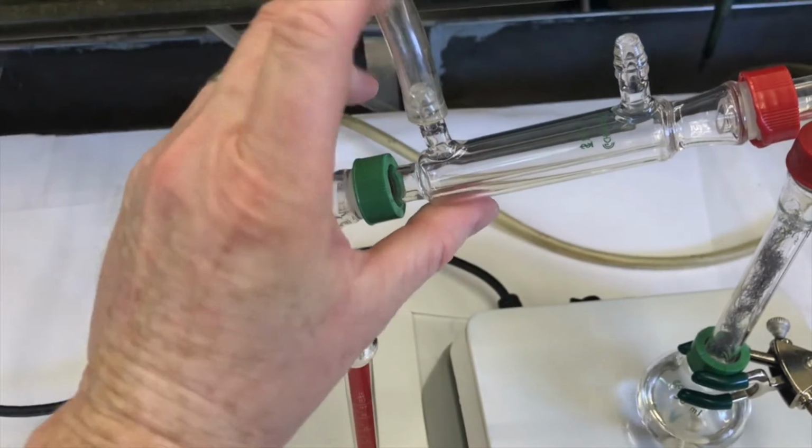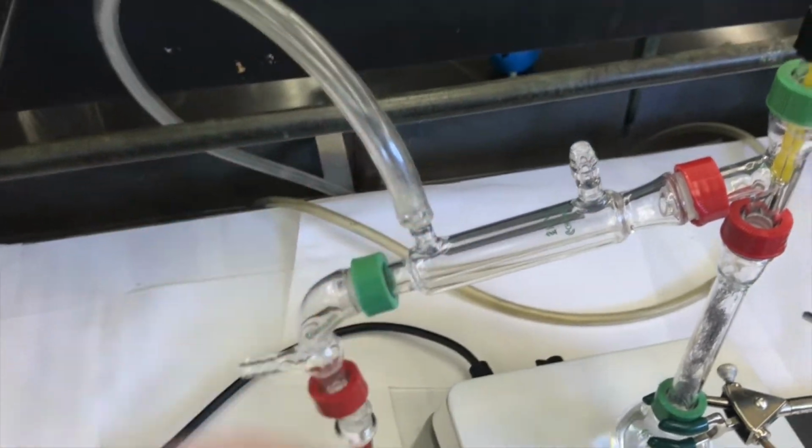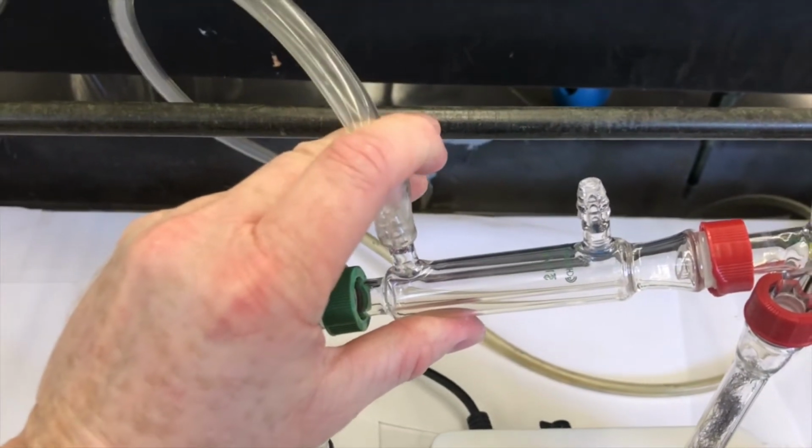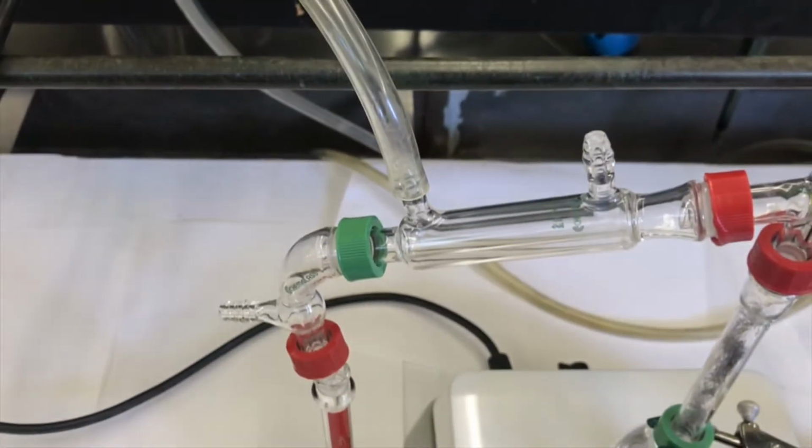So put this on. I have to make sure these are nice and snug, because if you don't and you turn the water on too high, they could shoot off and you've got sun splash, the water's shooting everywhere. So we want to avoid that. I'm going to use 2 hands. Let me pause the video.